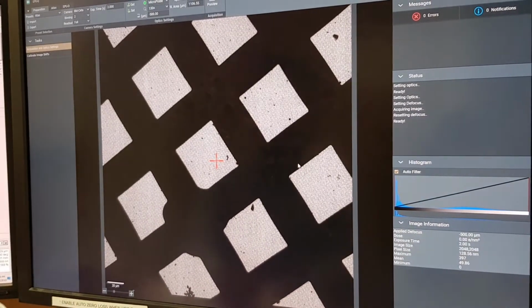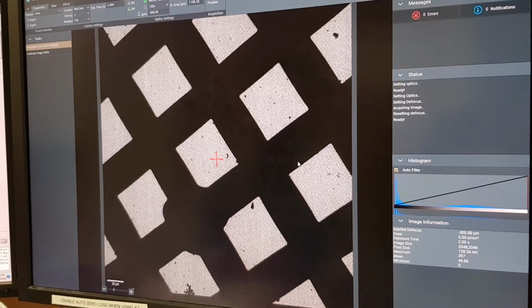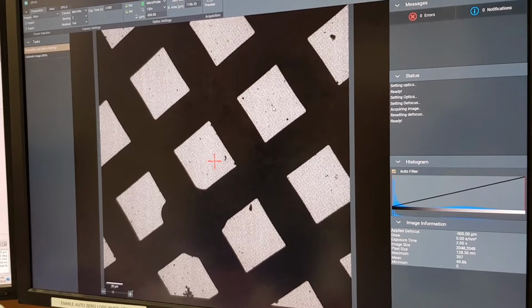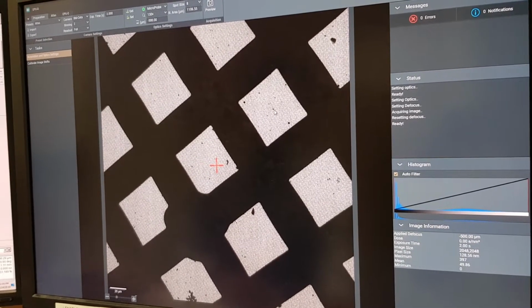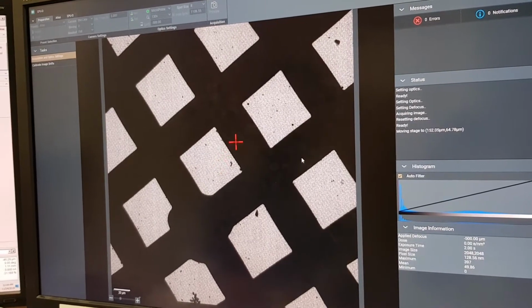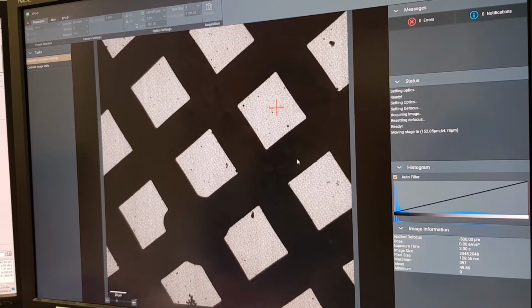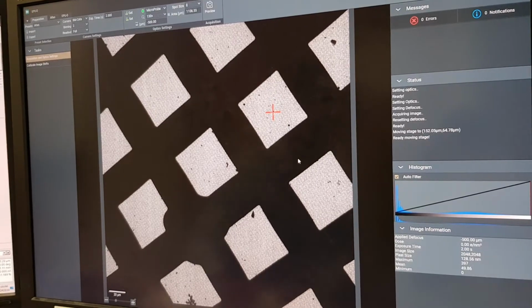These particles come from manually grinding the drug into a smaller powder and applying it to the grid. But before you load the sample, you need to use some nitrogen gas to blow away all the particles not strongly attached to the grid, leaving only the ones attached tightly. Then you leave it over there. Now I can move the stage to some of the small spots over here, which are our potential targets.